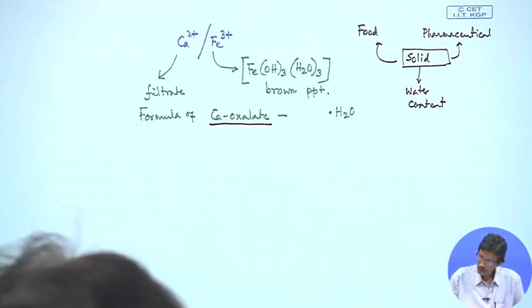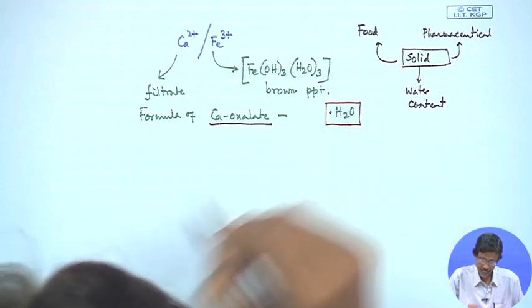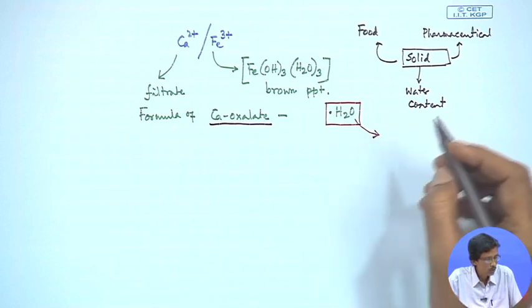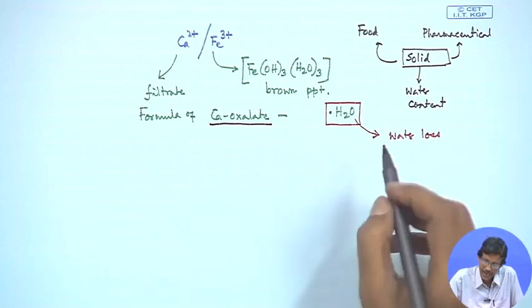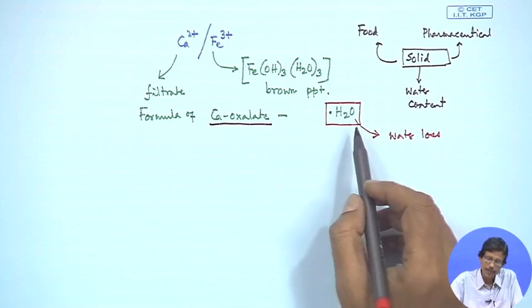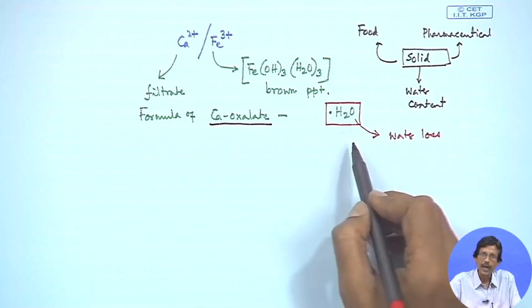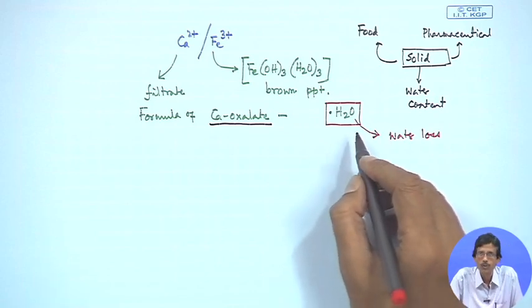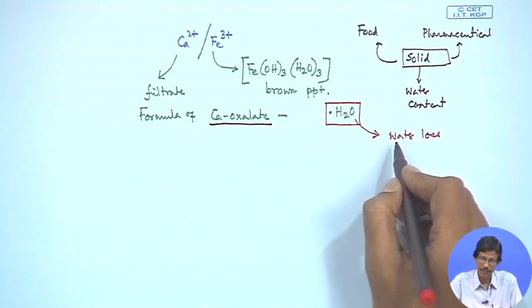So, this water content is always very important, and we want to know it when we go for the TG analysis of any of these samples, because at a particular temperature this will go for the water loss, which is the first step, and we can apply that information as we have discussed earlier in case of drying the precipitate of nickel DMG, nickel dimethyl glyoximate, in an air oven. So, we should set a particular temperature, and we should know at what particular temperature we can dry the corresponding sample of nickel DMG.